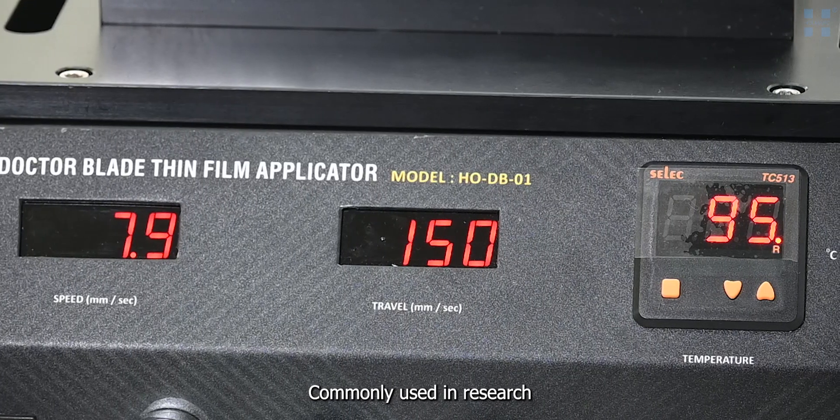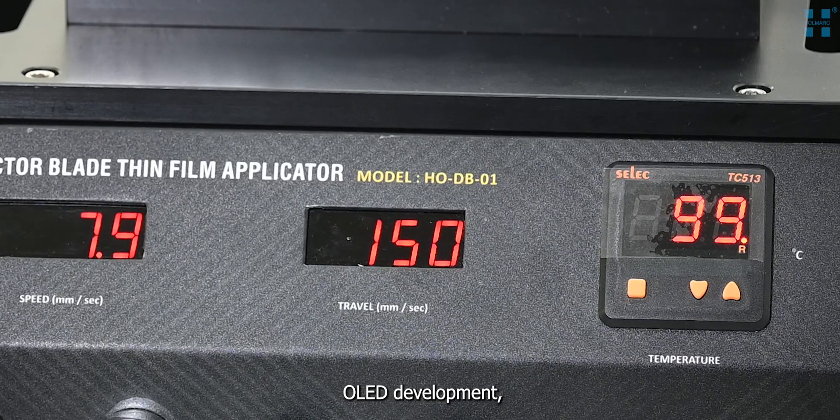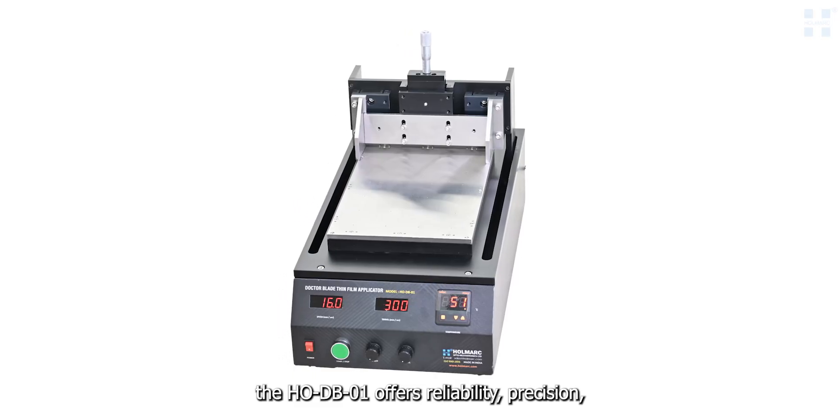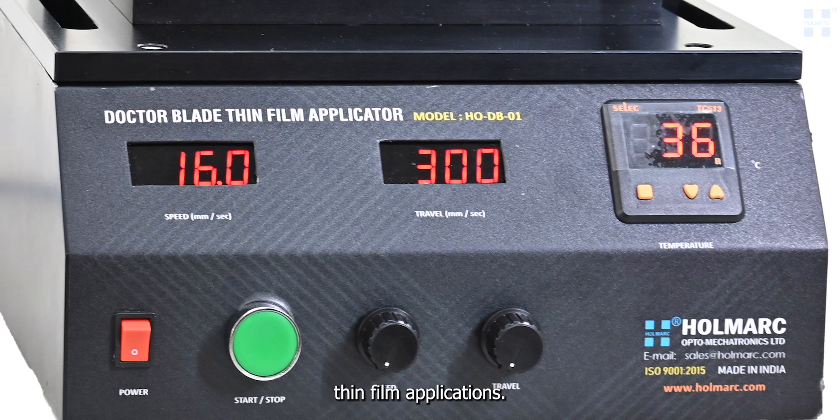Commonly used in research fields like solar cell fabrication, OLED development, and battery electrode coating, the HODB01 offers reliability, precision, and ease of use for high-quality thin film applications.